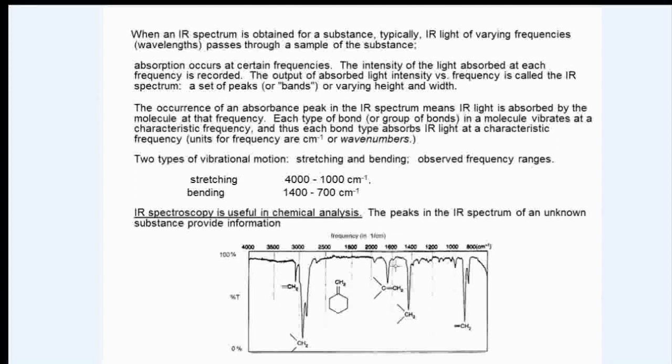Then as we move further to the right, the next peak we come to, this is no longer a stretching motion, it's a bending motion. It's the HCH structural unit undergoing a scissor open, scissor closes bending motion. The HCH bending vibration that's creating that narrow peak at about 1450, it looks like. Moving further to the right, next peak we come to looks about around 900.